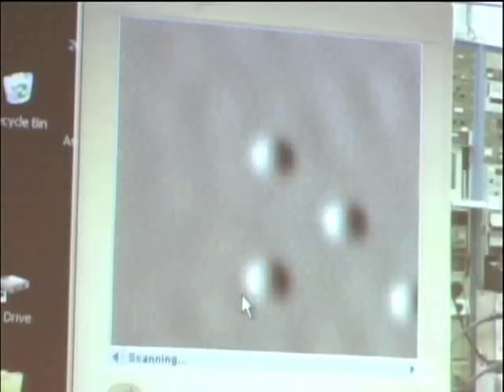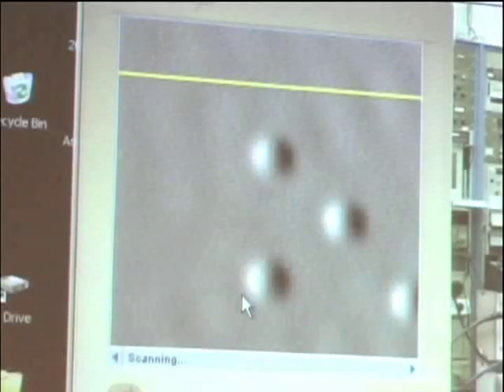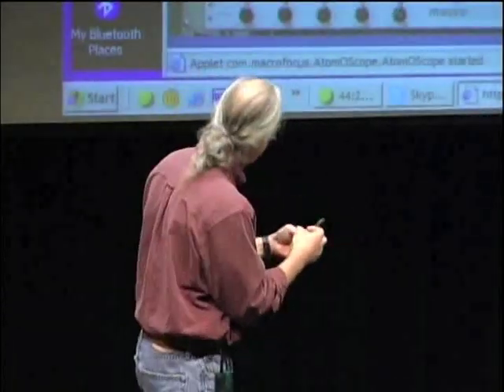So you see how easy it is? You just press some buttons, you just click and drag, and you move the atoms around. These are real sticky atoms. If we brought two together, they would form sort of a two-atom kind of molecule that we wouldn't be able to take apart. So I'm not going to do that right away. But there you see it.